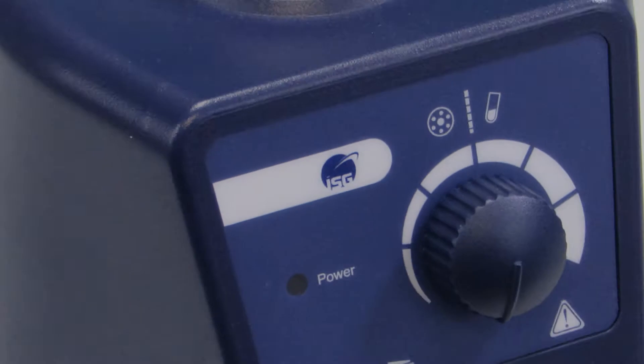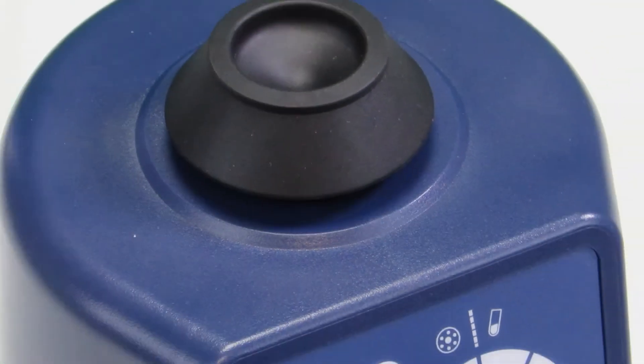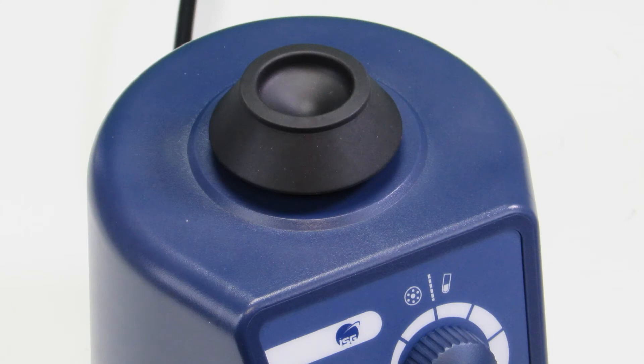The ISG Vortex Mixer is a compact variable speed unit that will spin between 0 and 2500rpm and can be used for vigorous resuspension of cells in tubes up to a 50ml capacity.